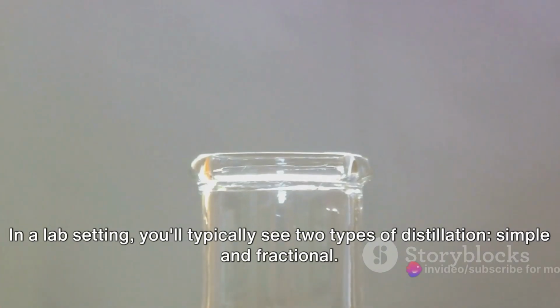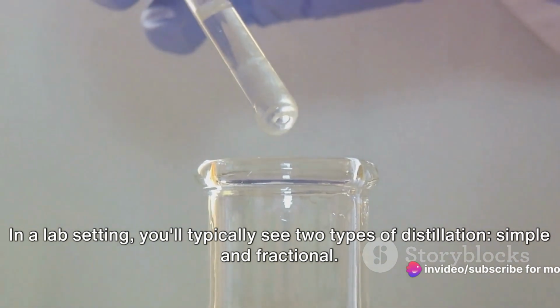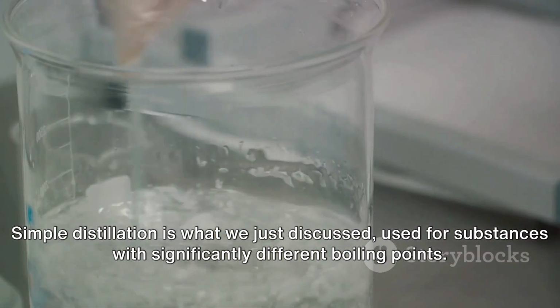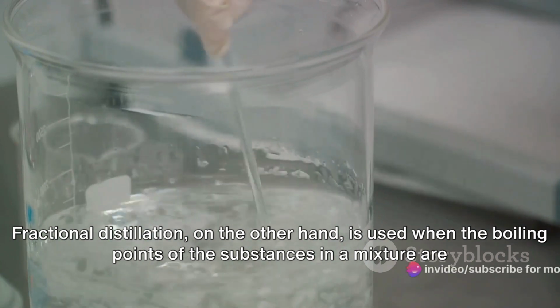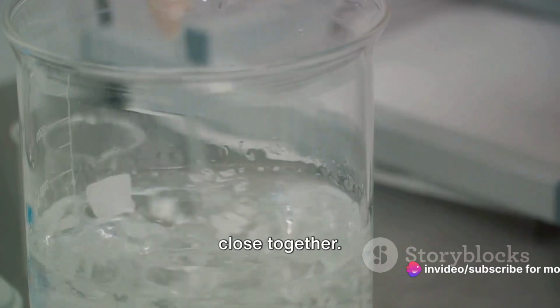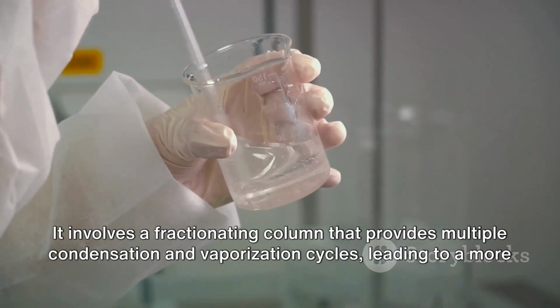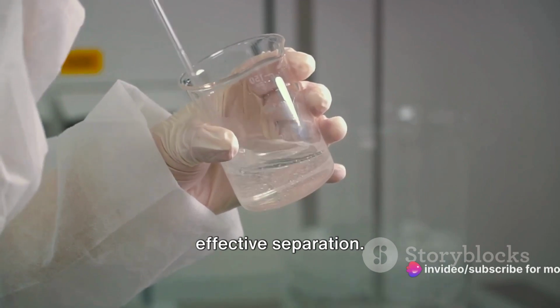In a lab setting, you'll typically see two types of distillation: simple and fractional. Simple distillation is what we just discussed, used for substances with significantly different boiling points. Fractional distillation, on the other hand, is used when the boiling points of the substances in a mixture are close together. It involves a fractionating column that provides multiple condensation and vaporization cycles, leading to a more effective separation.